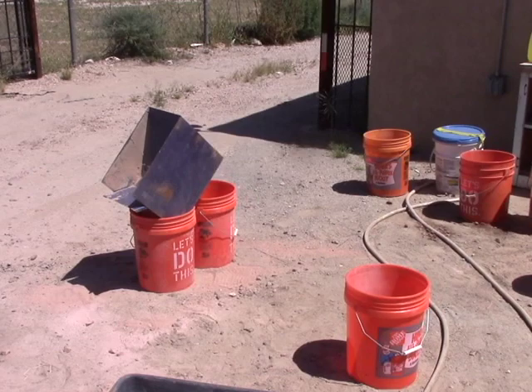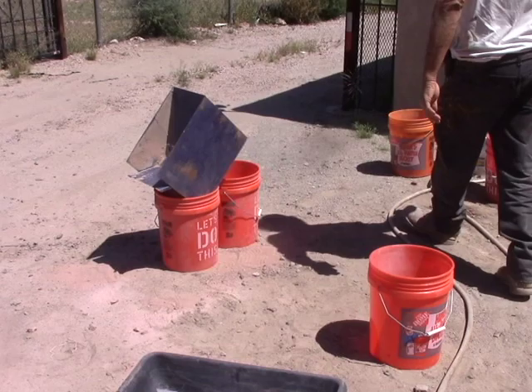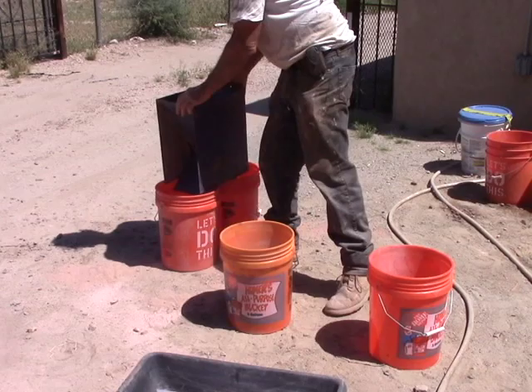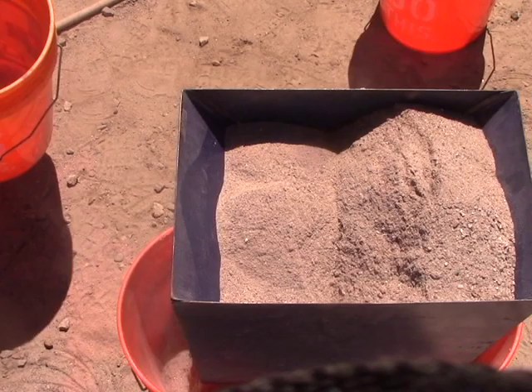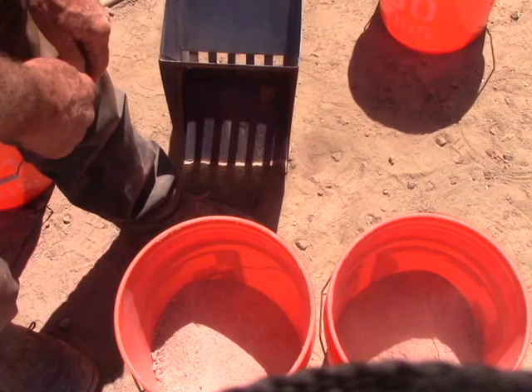Now I've got them all crushed and I'm going to split it down. Here's my splitting area — let me show you how easy this is. Here's the sample. The splitter has alternating openings, an equal number to each bucket, so if you do that it splits the sample evenly. And there you go.